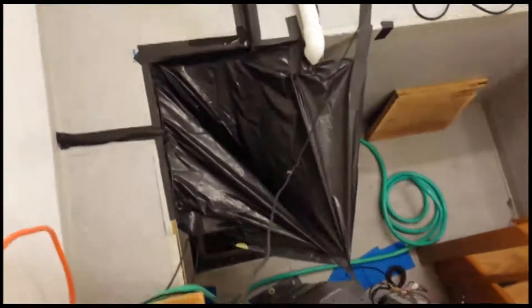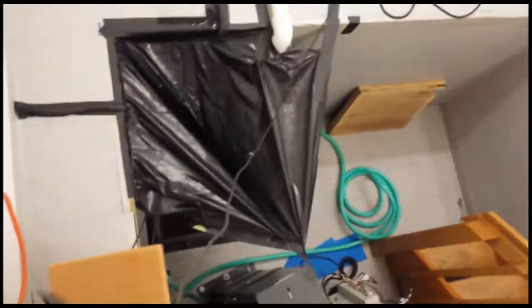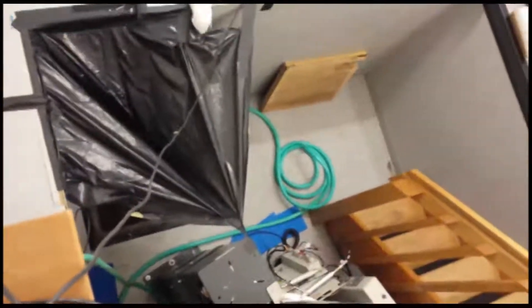Here you can see the water coming up out of the wall, flowing to our dam made with gaff tape and rolled up paper towels. It goes to our homemade funnel made of a garbage bag with gaff tape, taped to the magnet leg.